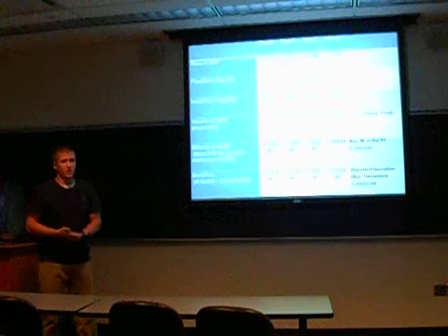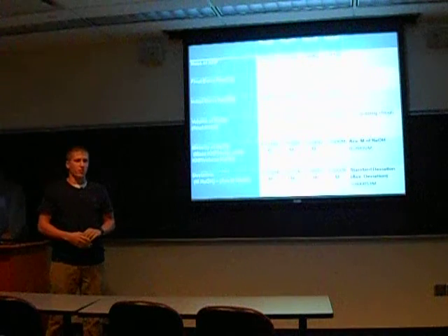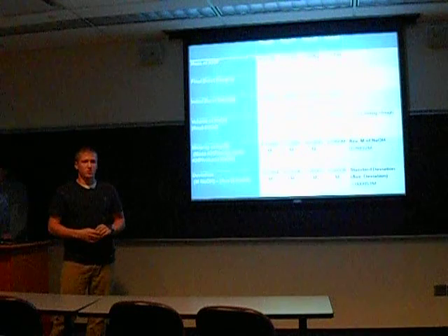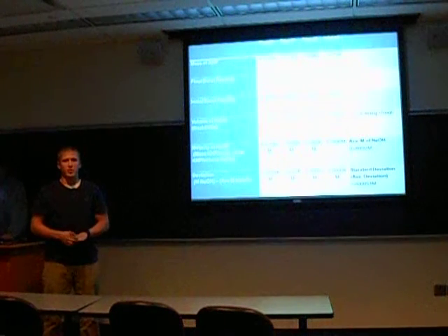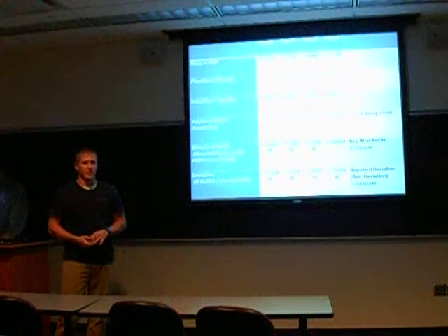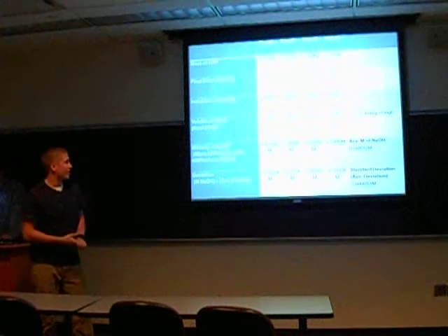Okay, and this is our results table. In the top line you'll see there is the amount between 0.3 and 0.4 grams. We actually tried to get as close to the same number so that we would know around what number it was going to change depending, so we wouldn't have to take so many samples and things like that.